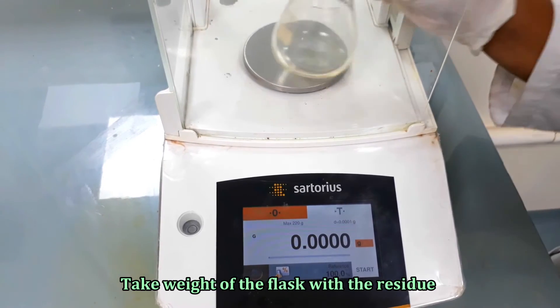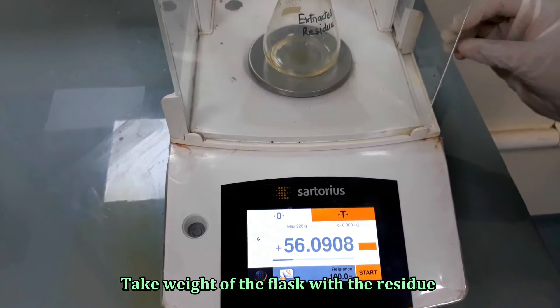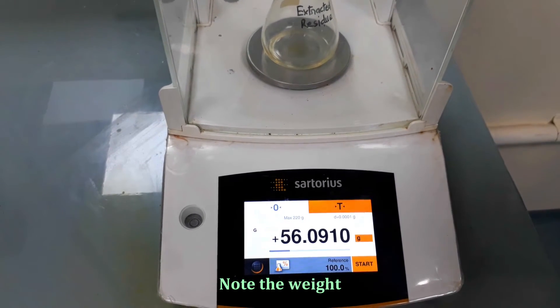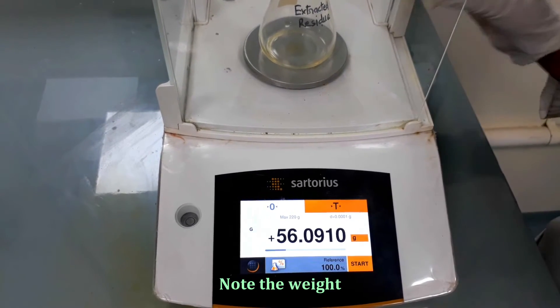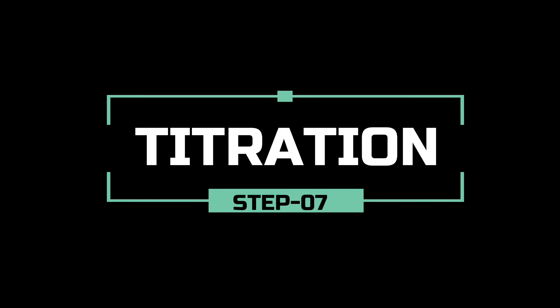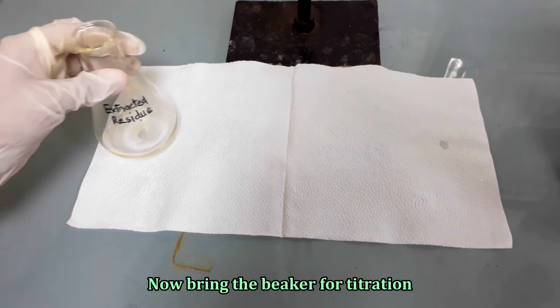Take the weight of the flask with the residue. It's time for titration.